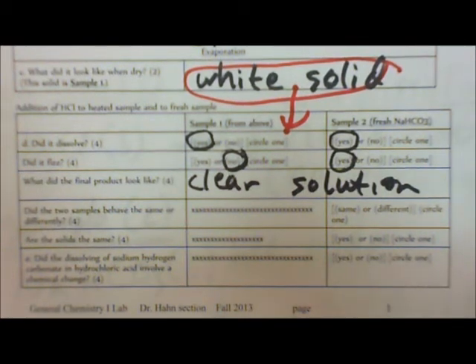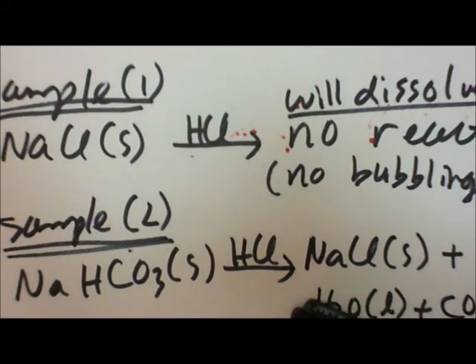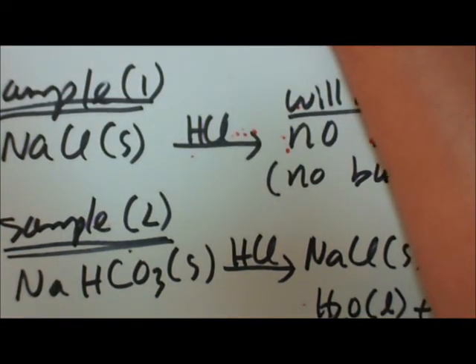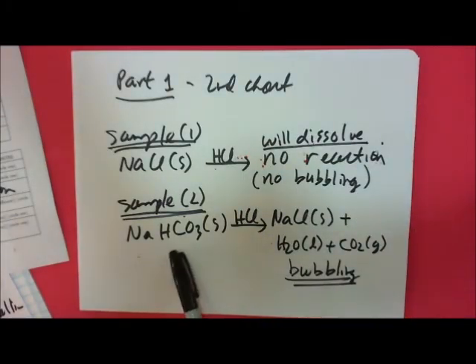Once again, when you are dissolving sodium bicarbonate in hydrochloric acid solution, you are actually doing a chemical reaction.